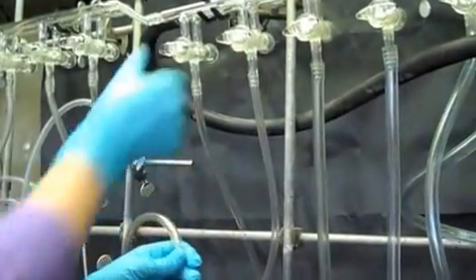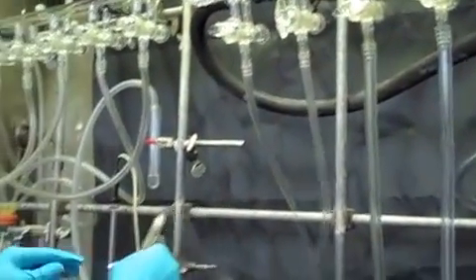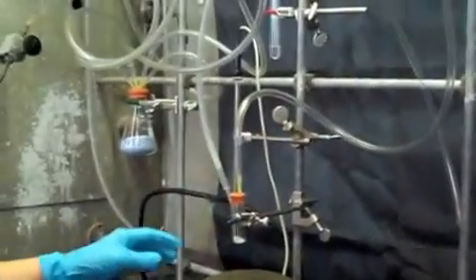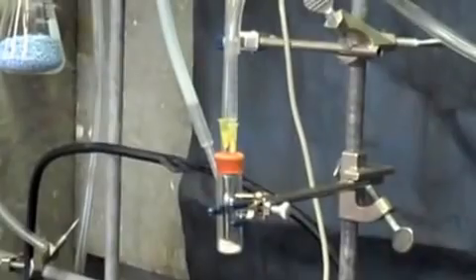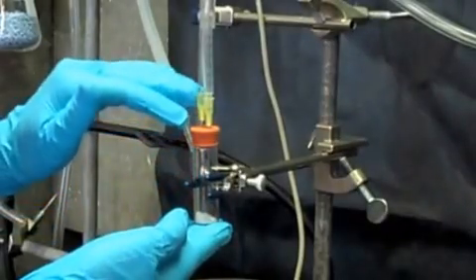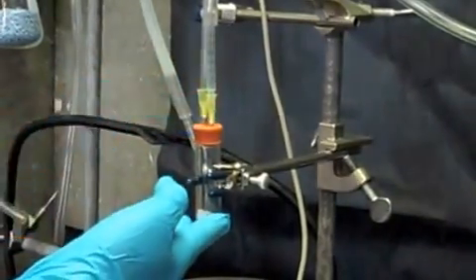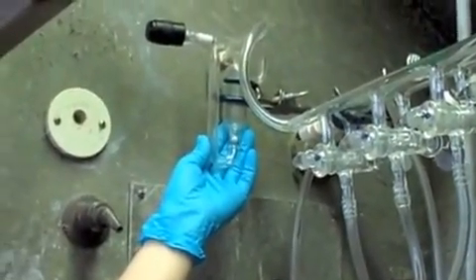With my needle in place, I'll turn the blue dot up to start nitrogen flowing through the needle. I'm going to place a second needle in here, and then we can just wait a few minutes. Nitrogen is flowing in through this tube, and it's pushing the air out of this vent needle. It's a good idea to check your bubbler at this point, and make sure that your nitrogen still is flowing.